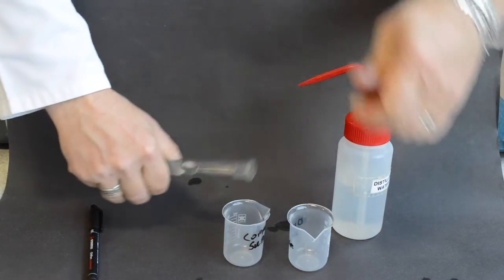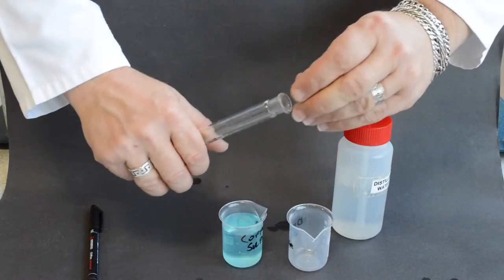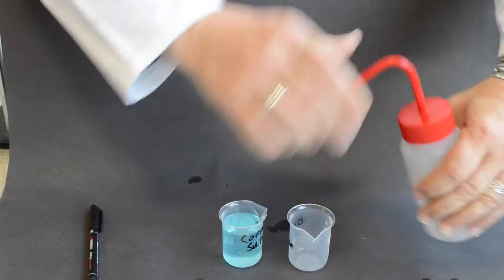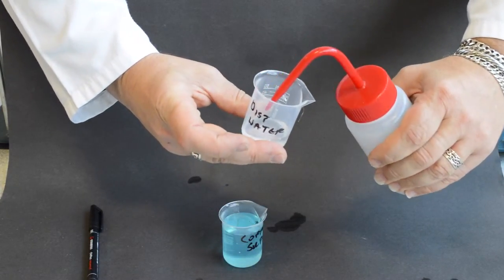Decant the sample of copper sulfate into a beaker so it can be easily poured into a burette. Repeat this process with distilled water.